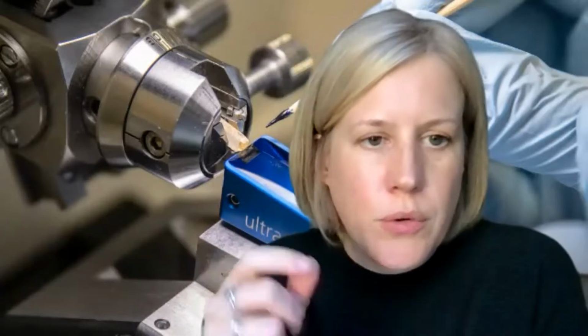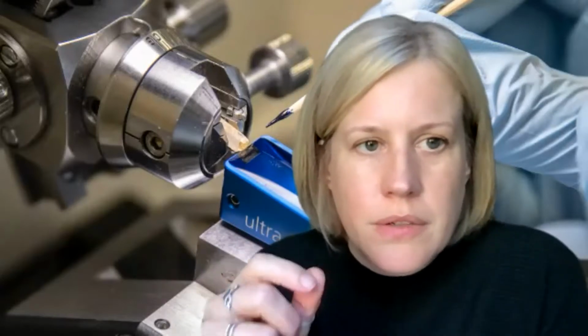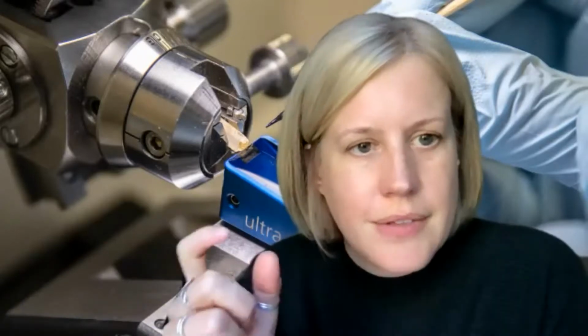So I think the key to this is going to be getting just a bit more contrast onto the membranes whilst keeping most of the individual protein fluorophores active and emitting. And I think these new probes are going to do that. I think once we see that, then actually there's not so much point necessarily in doing the fluorescence first, or you do your fluorescence first and get the dynamics, and then you preserve the fluorescence every time so that you can increase the localization later on. But that contrast compromise has to be overcome.